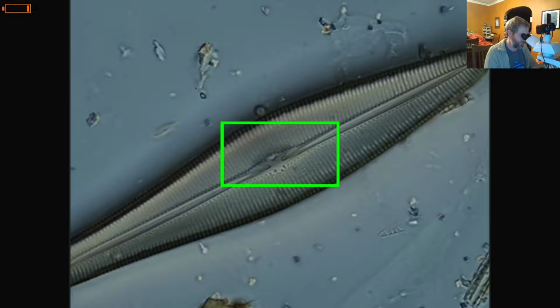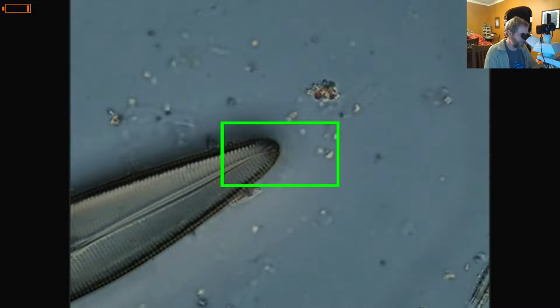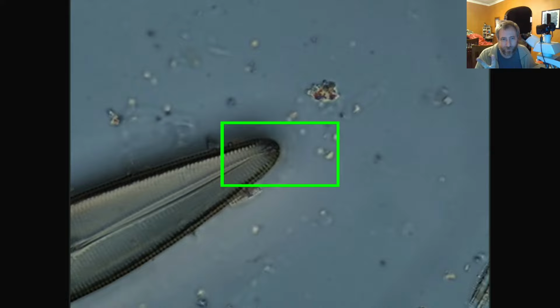And this one I like to call the horned beast, because the horned beast has little horns at the top. I don't know if you can see them. That's the head pole. And way up on the head pole is sort of like a little fork-shaped structure. And it actually has two little spines that are growing off the front end of it. We could see it in the stream on the SEM images pretty clearly, but in the light microscope, it's actually kind of hard to see. They're just two little bright spots right up there at the top, but they're actually sticking up together like goat horns off the front end of it.